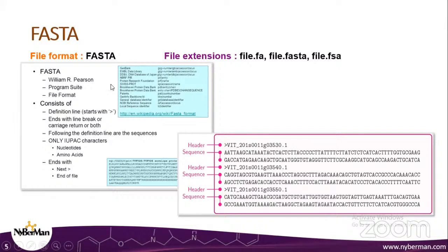Like here in the second figure, you can see the nucleotide sequences are given in the second row after the header. The header will give information about which organism you are using, or on which machine or sequencer it has been processed, so that whenever there is a difference in your FASTA file, you can understand that it was processed on this particular sequencer. Sometimes the header has more information, like which chromosome this particular sequence belongs to. So the header also varies based on the sequencer.